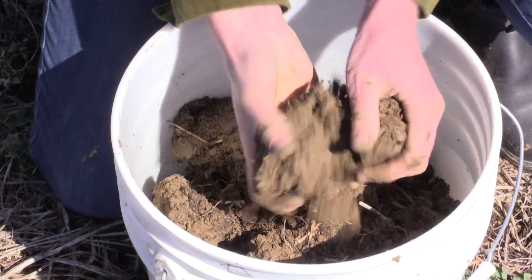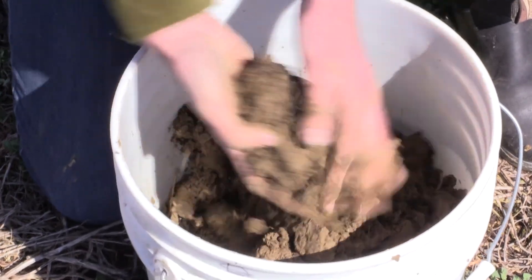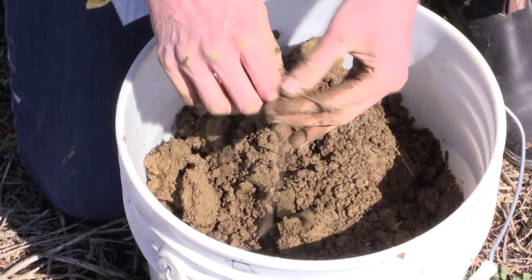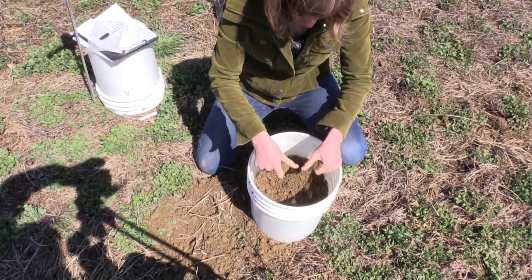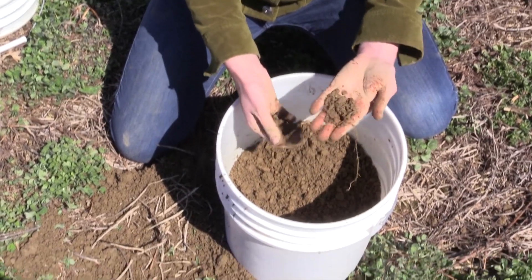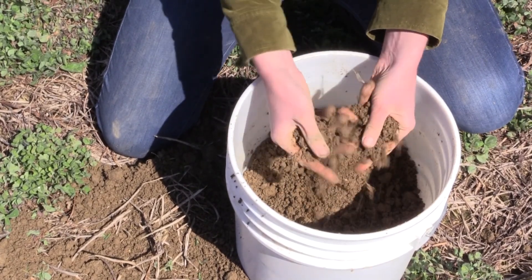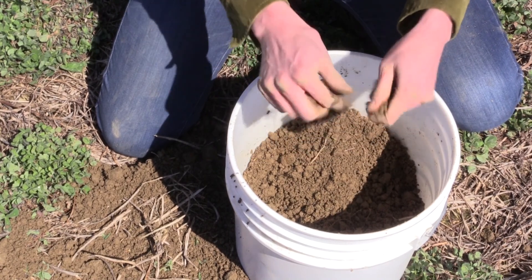Now that I've taken 10 subsamples across the field in a W-shaped pattern, I will mix the sample extremely well. At the same time, I'm pulling any plant matter out to make sure we have an accurate sample to send to the lab. The soils are a really nice consistency for sampling — you can see how the aggregates just sort of crumble apart, showing we have good structure and probably good microbial activity.